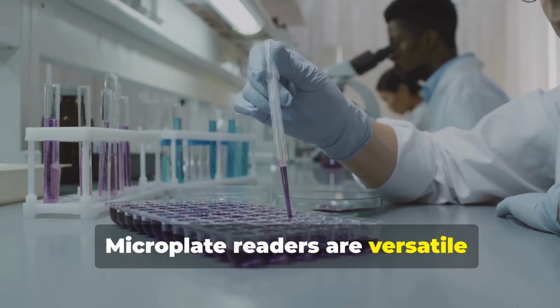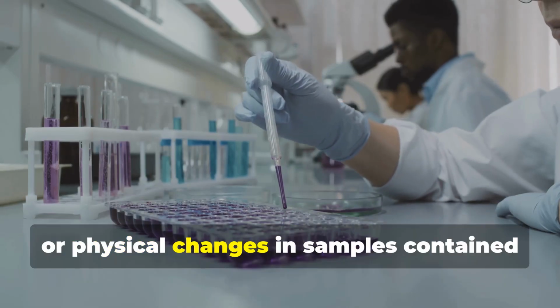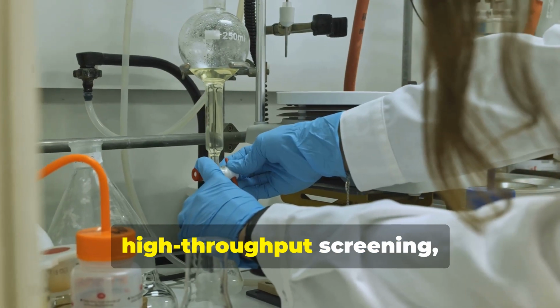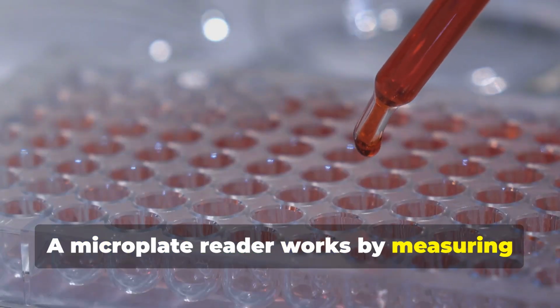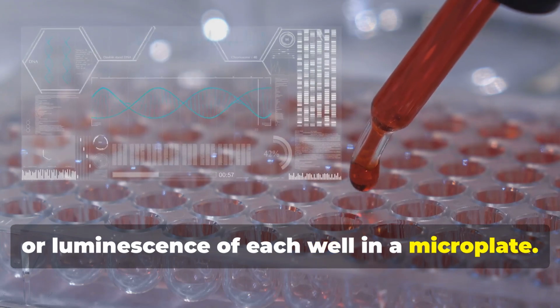Microplate readers are versatile instruments used to detect and quantify biological, chemical, or physical changes in samples contained within microplates. These devices are essential for high-throughput screening, enabling the analysis of multiple samples simultaneously. A microplate reader works by measuring the absorbance, fluorescence, or luminescence of each well in a microplate.